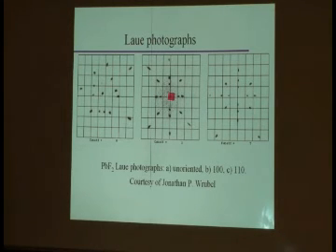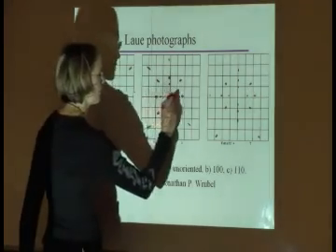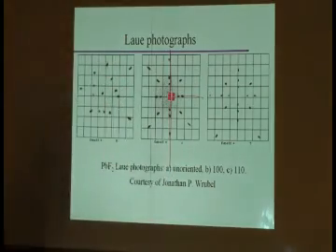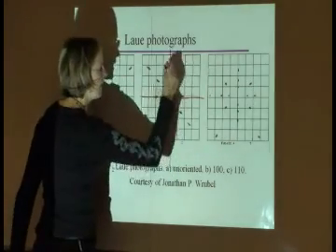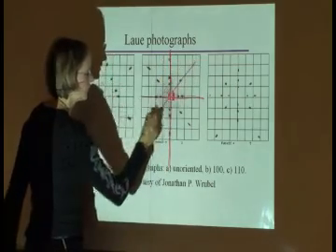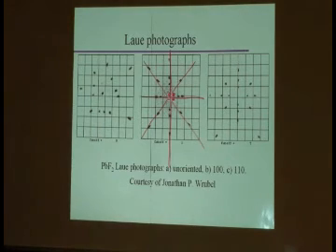So, fourfold symmetry. Anything else? Mirrors. And Chris claims I have a mirror here, and I have a mirror here. And of course it should be right on top of the spots. And I am offered the diagonals. Does everybody see these? Everybody agree?